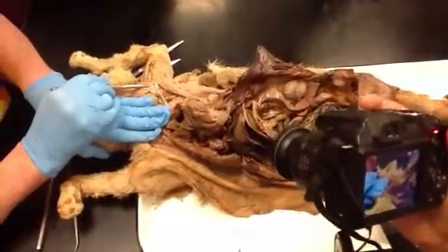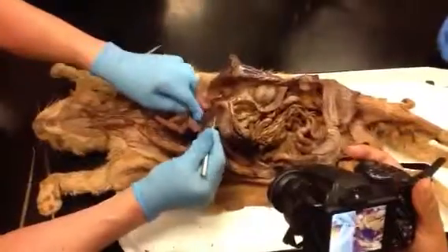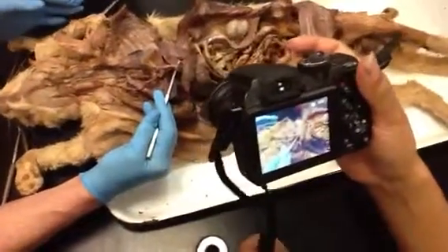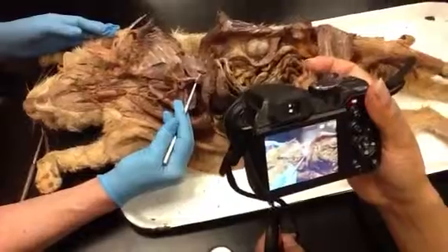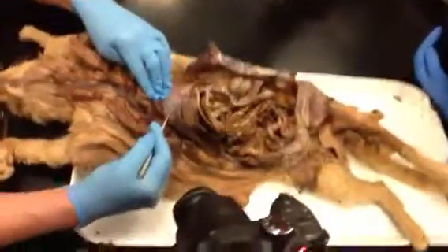There's one other vein. The other vein is this one. This is the inferior vena cava. Okay? So I perforate diaphragm. I'm now going to find the liver.